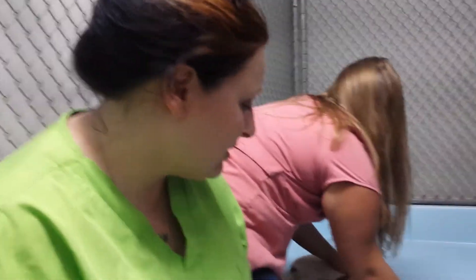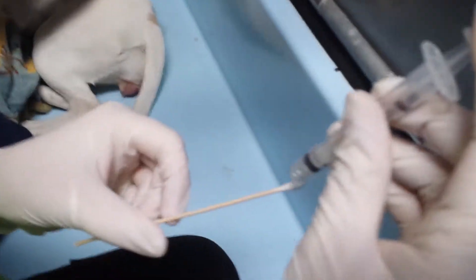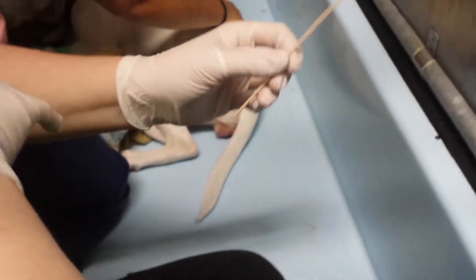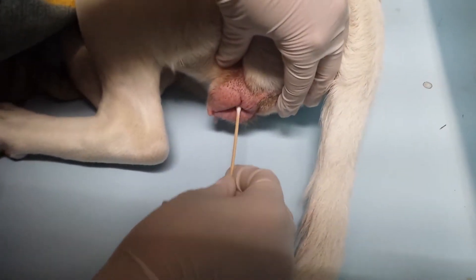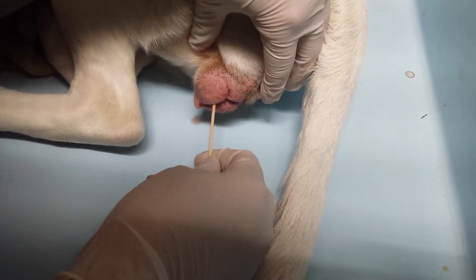This is task number 13, so we're going to do a vaginal smear. We're going to moisten our swab here in some saline, and then Morgan holds her. We're gonna go ahead and gently insert and rotate so we get a good sample of cells. And then we're going to go back out here to our microscope.